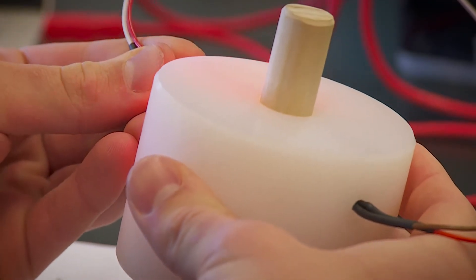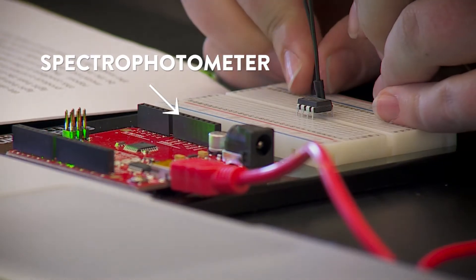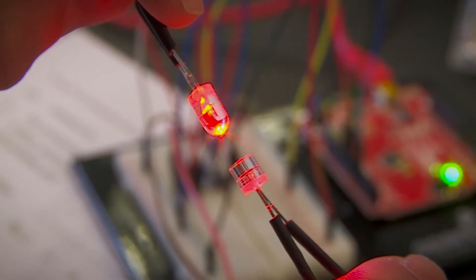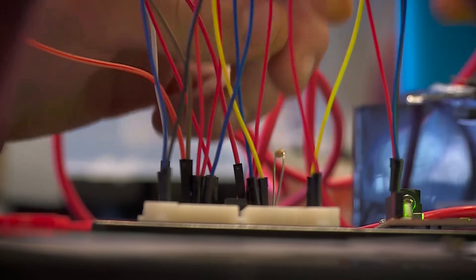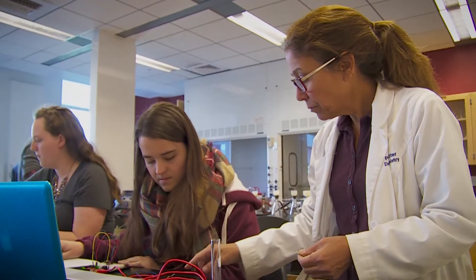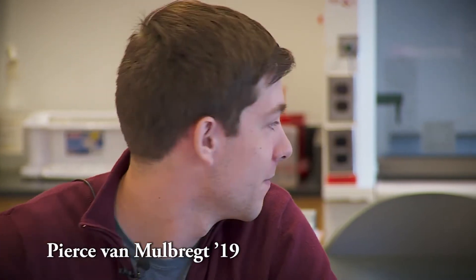We are building a spectrophotometer. A spectrophotometer is a pretty common chemical tool to measure light in a sample. Before this class I didn't really understand how they worked. So the importance of this project is to fully understand how a spectrophotometer works, and then we can advance this kind of technology to make the really fancy ones that we have over there.